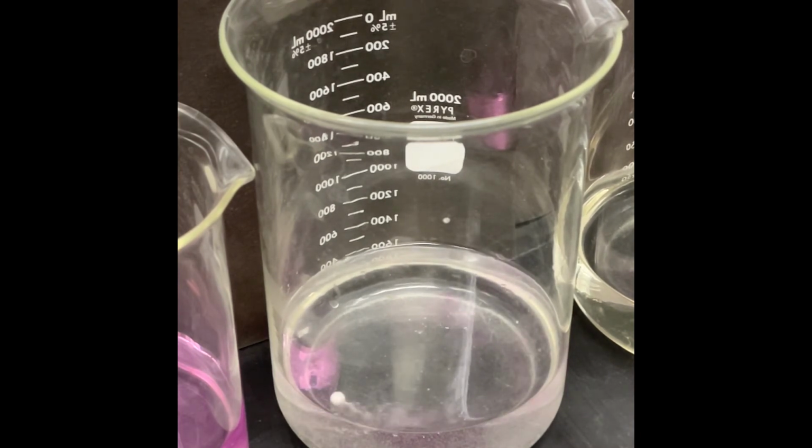Even though sodium reacts more quickly with water, this bead seems to stick around a little bit longer because it's generating so much hydrogen gas, it actually lifts itself up off of the water and doesn't come into contact fully, as lithium did. This is similar to the Leidenfrost effect, which is what happens when you put a drop of water onto a hot pan. It evaporates so quickly that it creates a little cushion of air and floats.